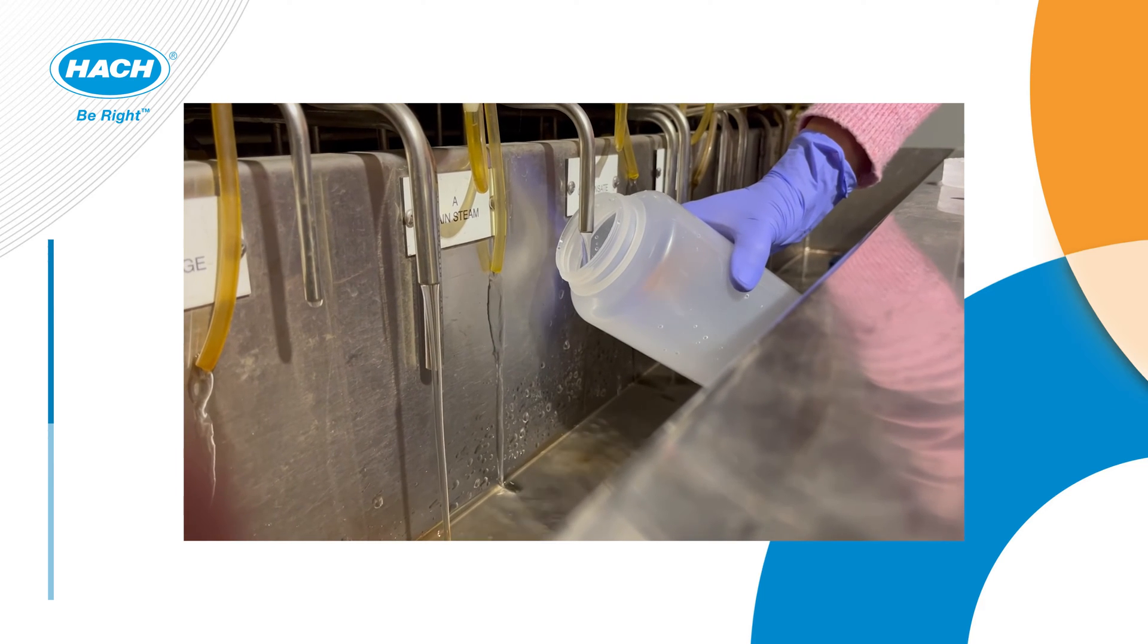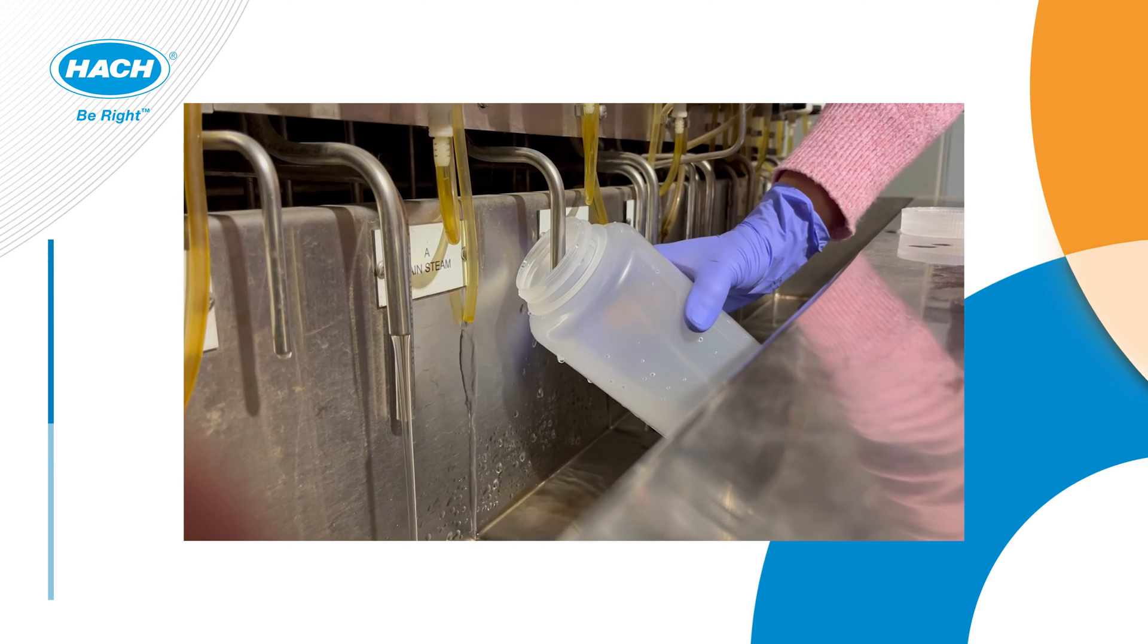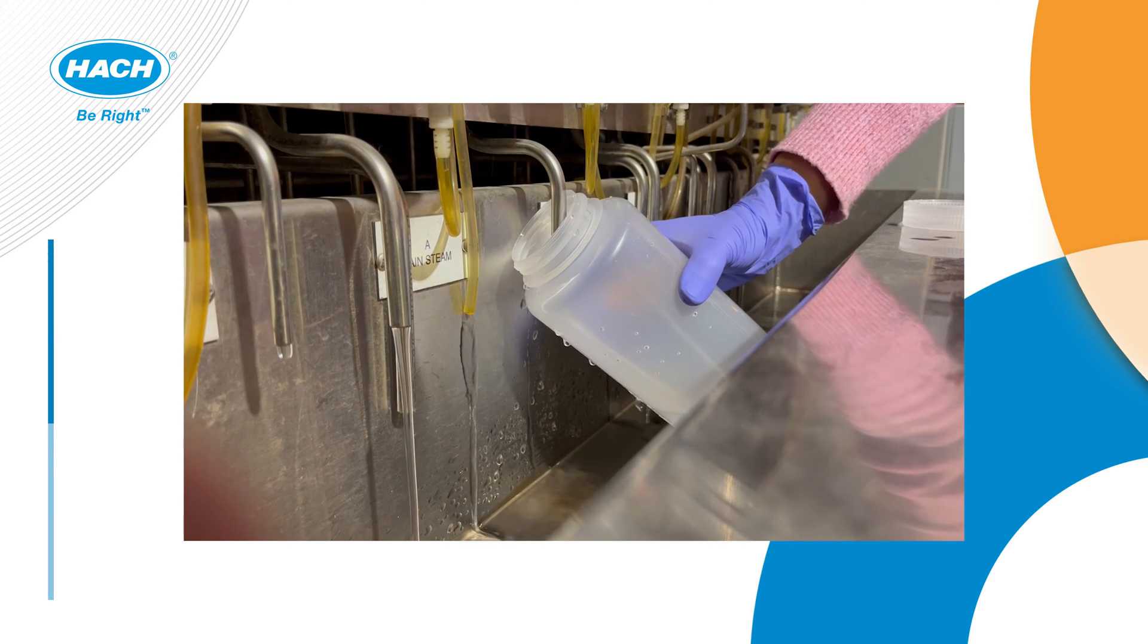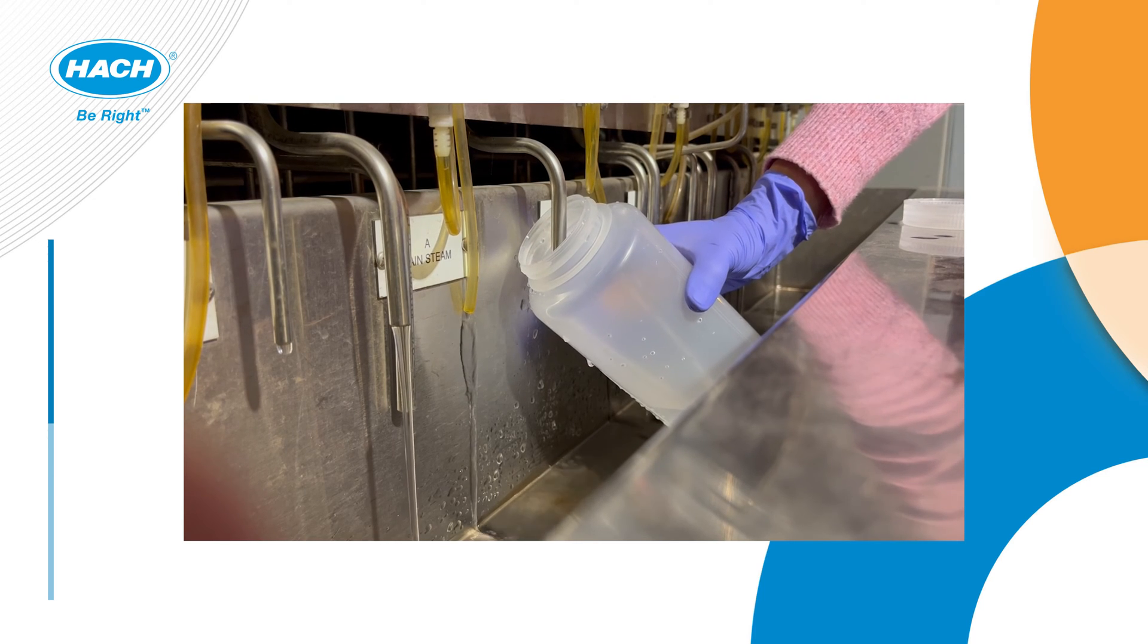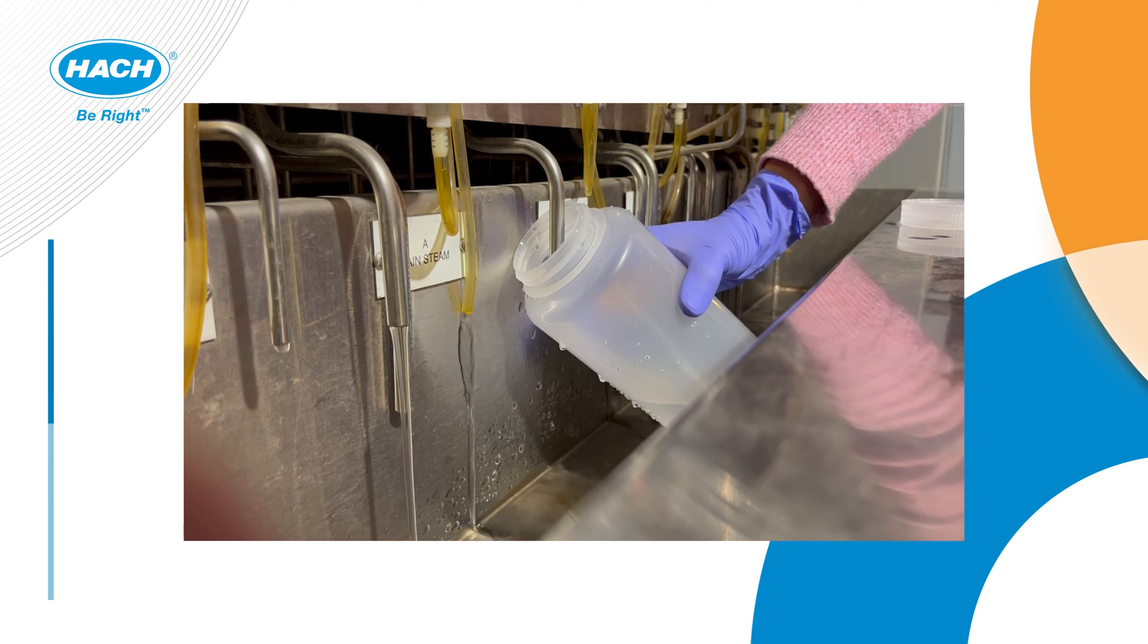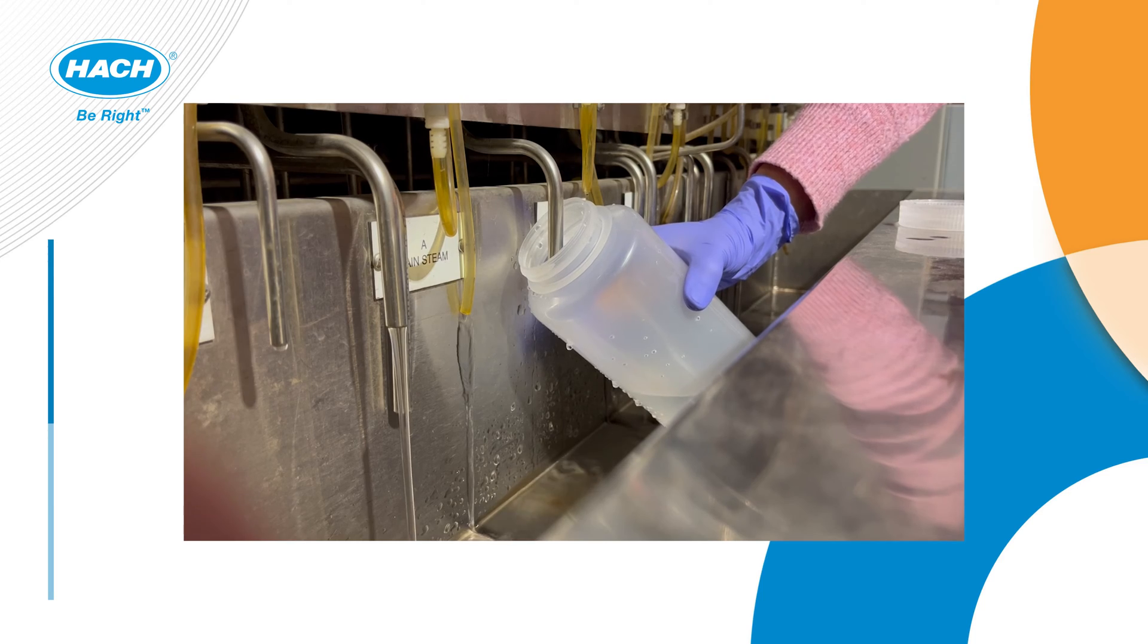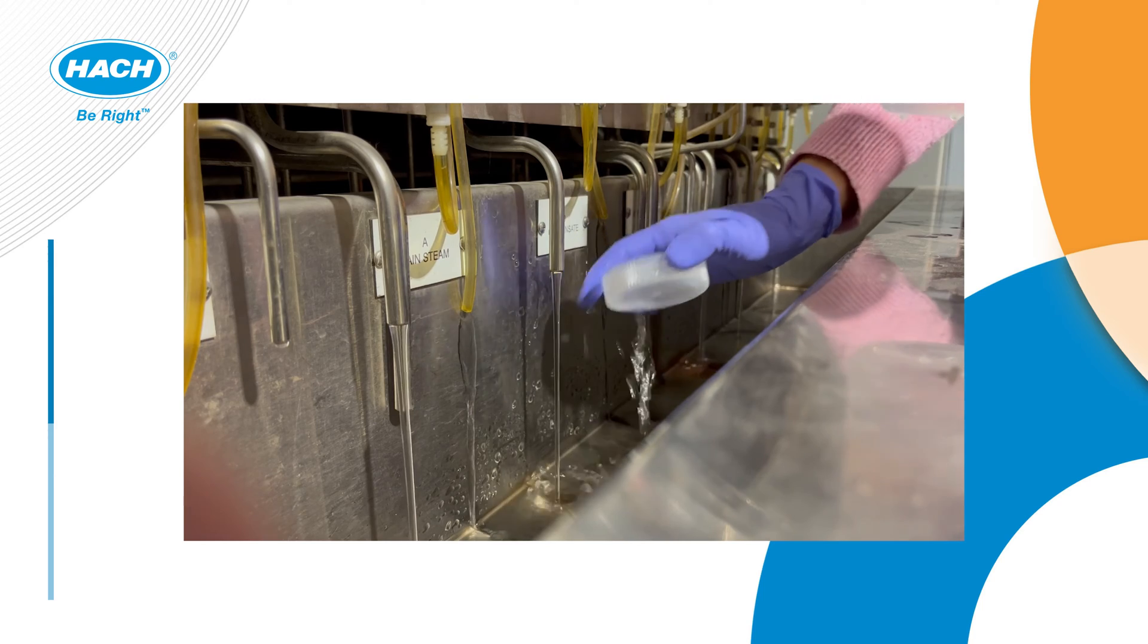In situations where you're not able to actually use the sample cell and need to collect a larger sample, it's very important that you consider the sample container as well as making sure it's rinsed. Use only polypropylene, polyethylene, or PTFE bottles. Do not use glass containers for obtaining this sample. The bottle and its cap must be thoroughly rinsed at least four times with sample prior to collecting.